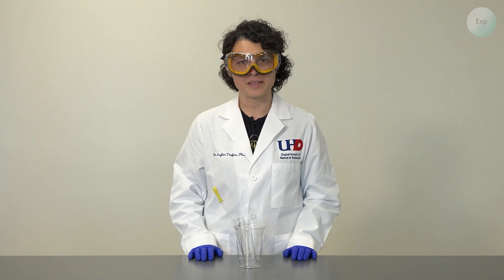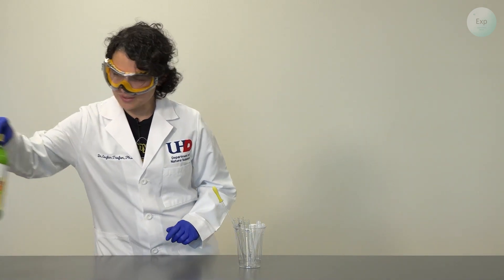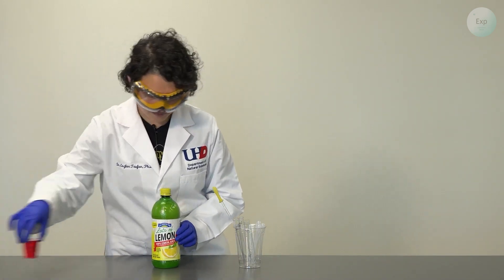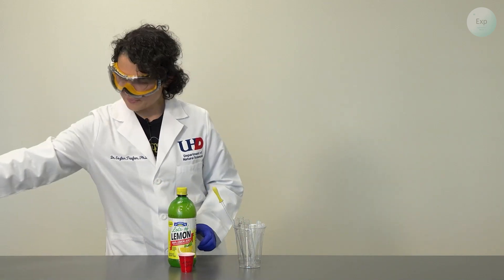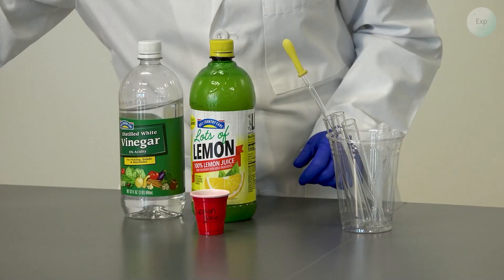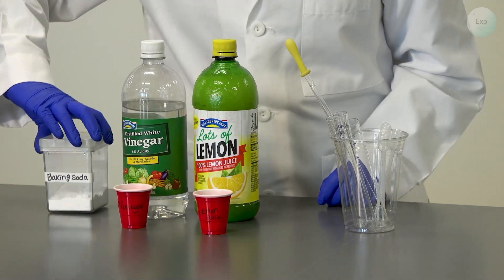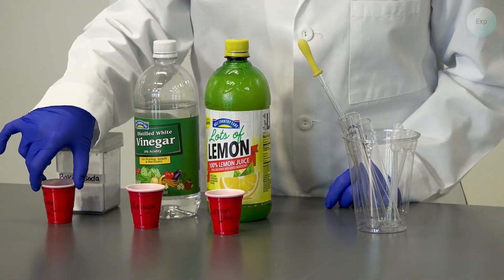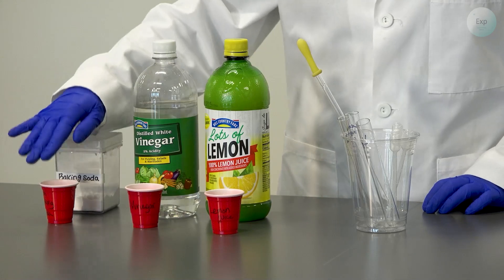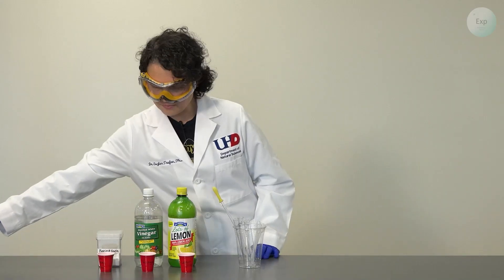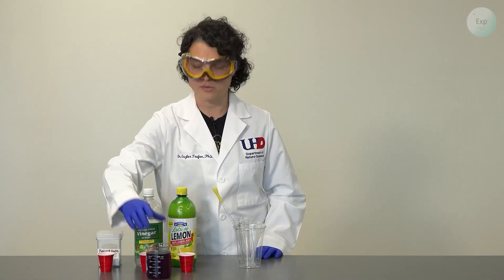Now for the materials that I will be testing today. First I'm going to test some lemon juice and I transferred some of it into this cup. I'm also going to test some vinegar and I transferred some of it in this cup, and I will test baking soda which I dissolved in some deionized water in this third little cup. And then finally I need my indicator solution.